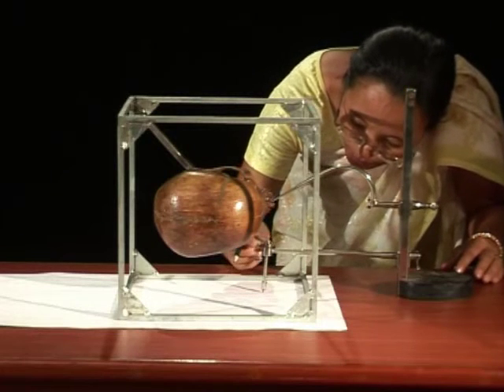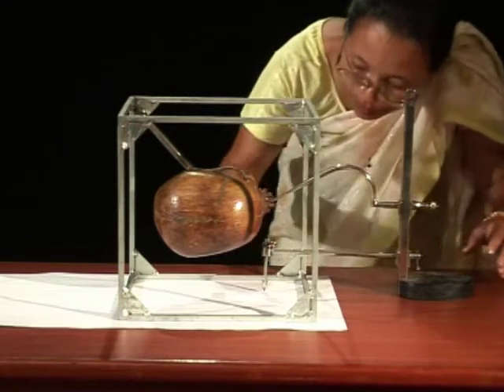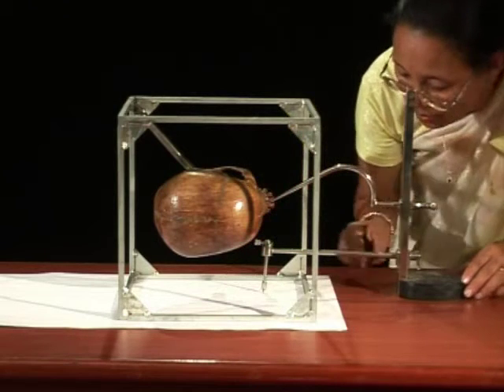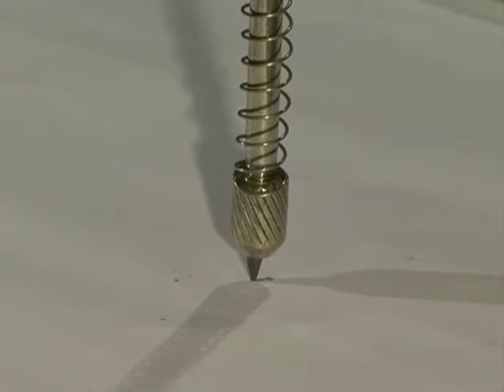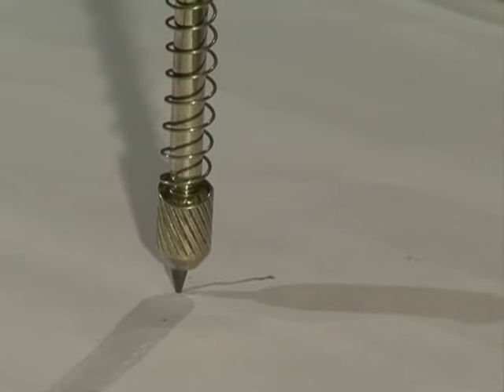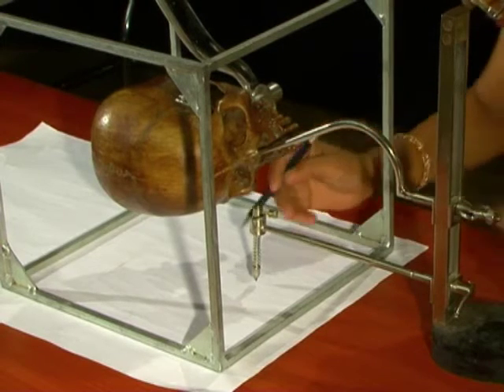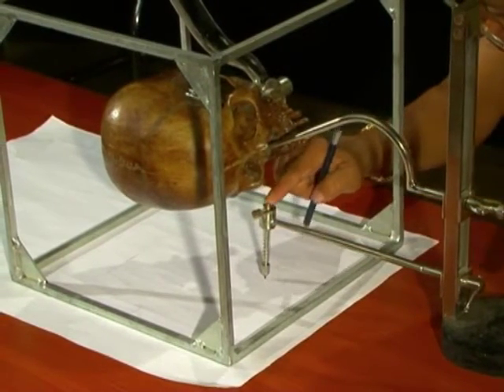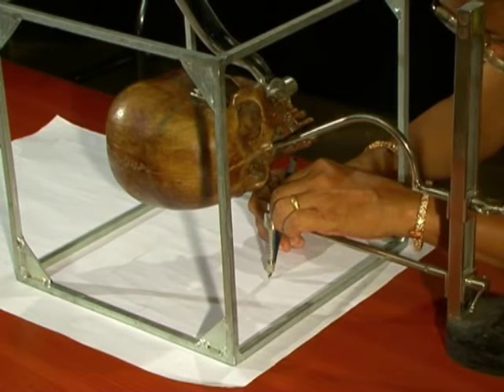Having all set in this position, the diagraph is then placed at right angle for drawing the contour of the skull. When the upper arm is moved, just touching the skull, the pencil makes a drawing of the same on the paper attached to the wall of the cube that rests on the table. While drawing the contour of the skull, the lead should be kept sharp enough so that it makes a clear impression on the paper.